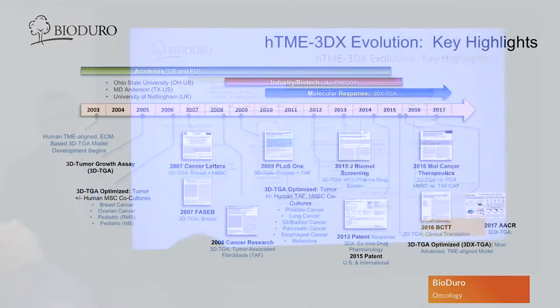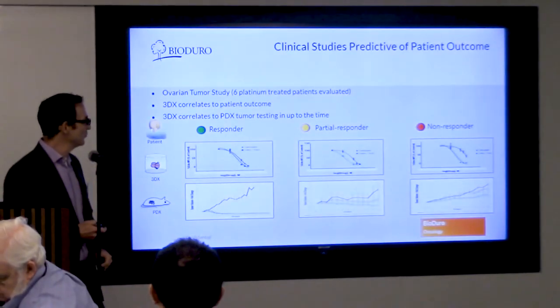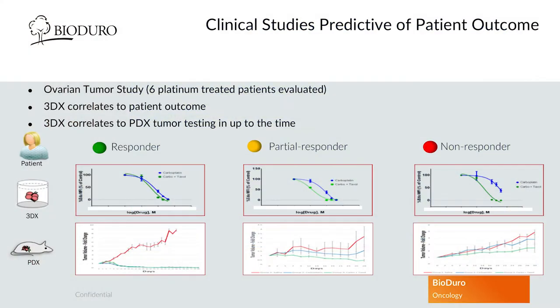So this is just convincing you that there's a lot of publications that we and others before us have put together on this. Happy to share any of these with you. And I wanted to put together this one slide, which gives an idea of the kind of clinical validity that we can see utilizing this human tumor microenvironment 3D culture system. So this is a small study. There's been a number of these that we've done, but this is one of these small studies where we actually looked at a handful, it's a low end, but still six ovarian cancer patients.